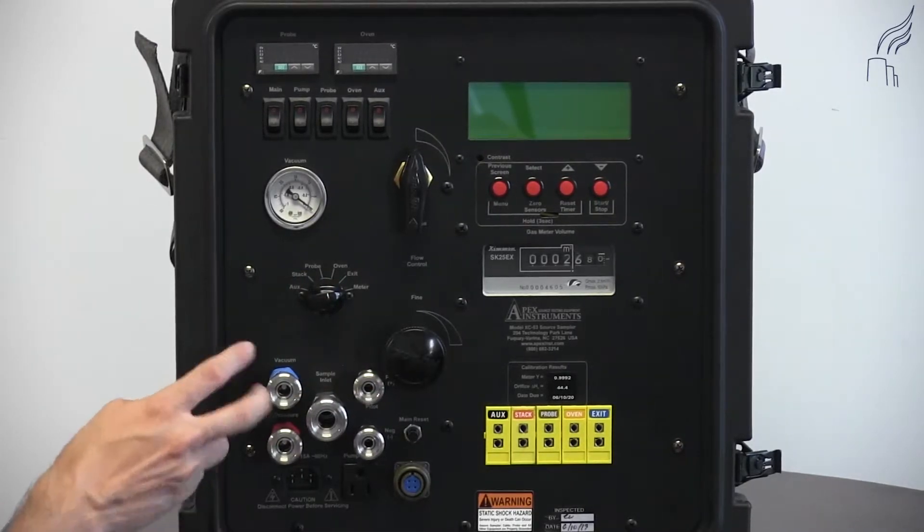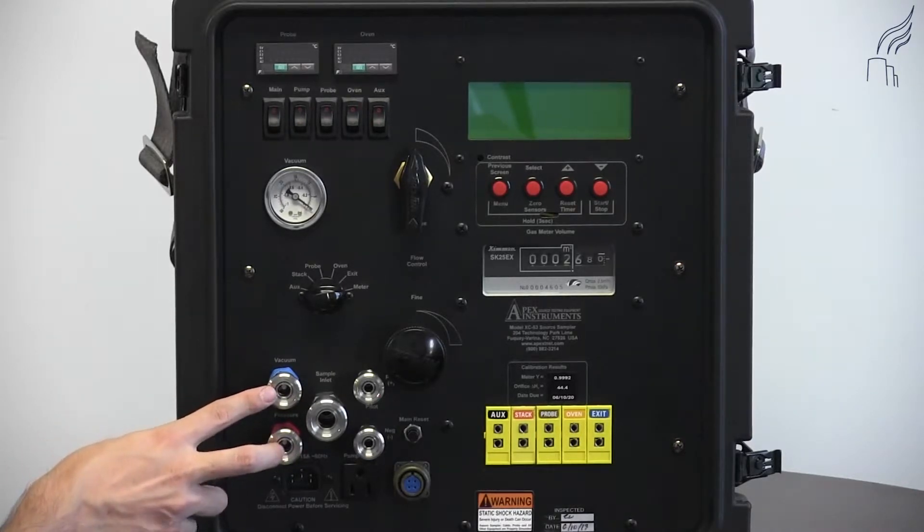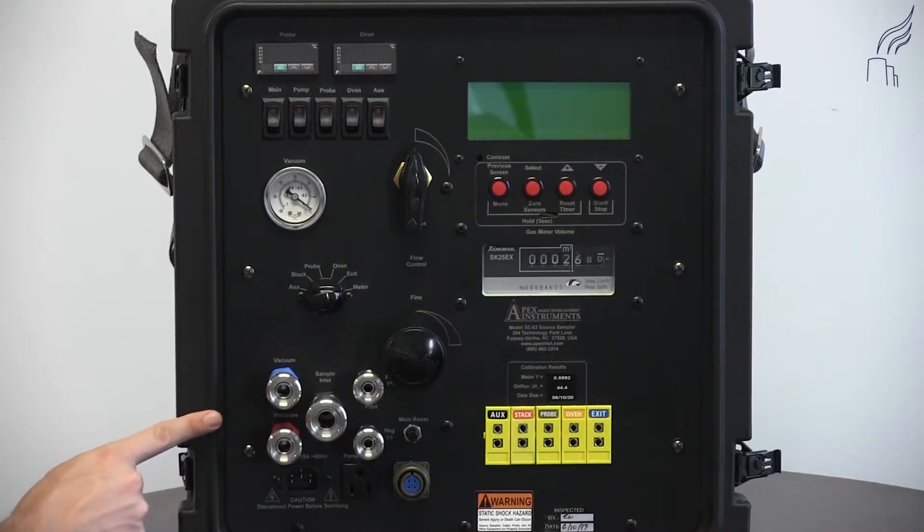Below this, we have our quick connects. For a booster pump — this is an optional feature, so not all consoles will have this — this allows you to put a booster pump in addition to the pump in the console to allow you to have more flow if needed.